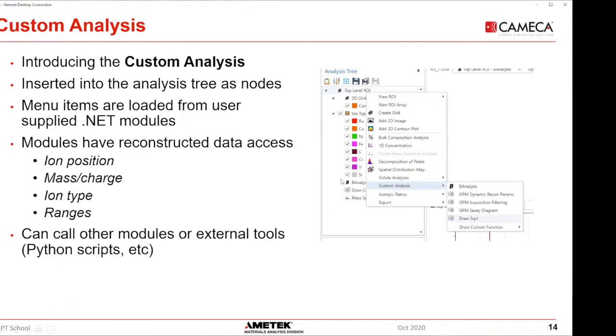Also, the custom analysis has an output, so it acts like an ROI itself. If you wanted to write a custom filter in your analysis module that used, for example, some of this arbitrary data that is in the file, you could make your new special type of ROI that filters based on multiplicity, for instance.